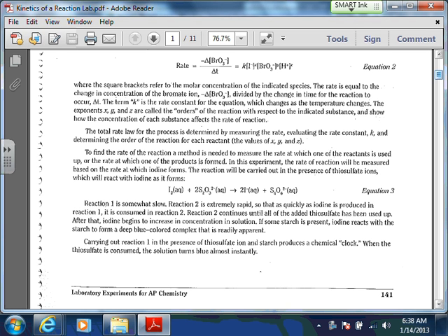You can kind of do this one of two ways. I would relate it back to the I2, so we can figure out how much I2 we basically needed here. If we figure out the number of moles of this, then we can use the stoichiometry to figure out the moles of the iodine, or the I2. All right. So let's say again, and this is hypothetical, this isn't going to be your number, but let's say we figure out we have 1.9 times 10 to the negative 8th moles of the S2O3 2 minus. I'm sorry about how hard this is to read.